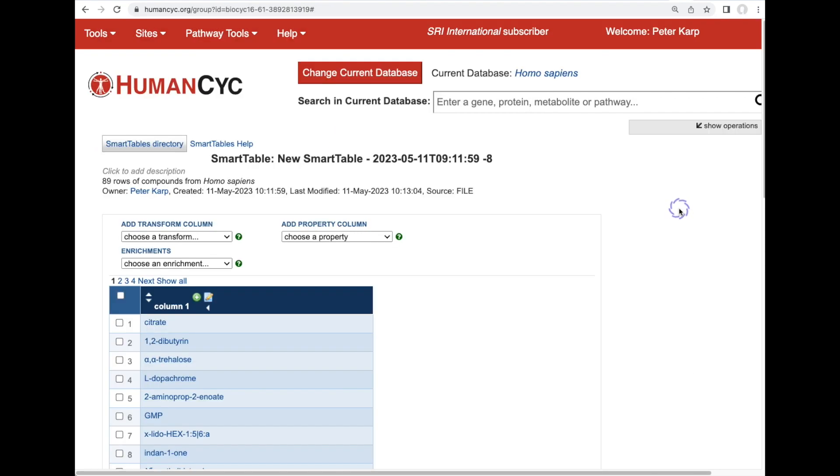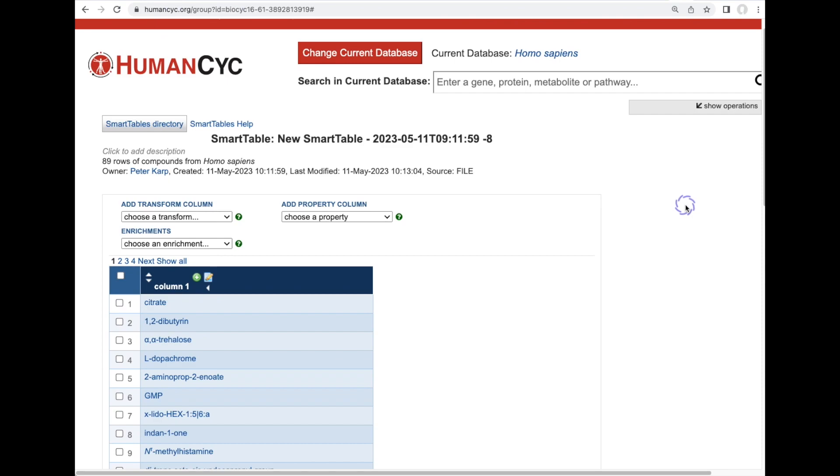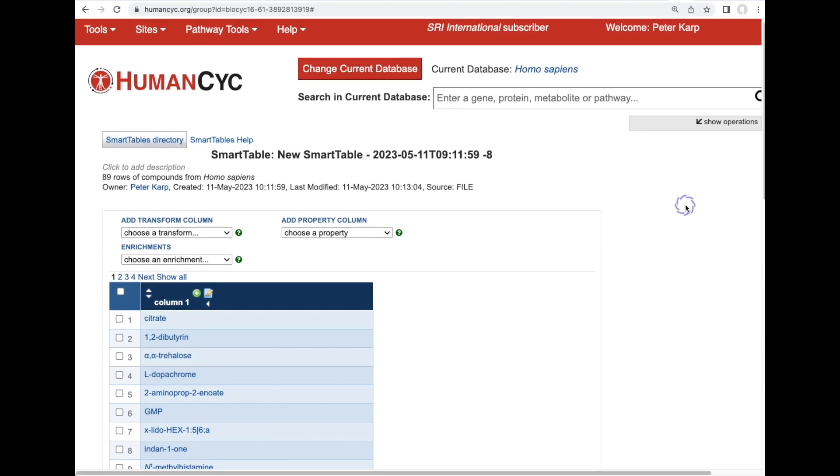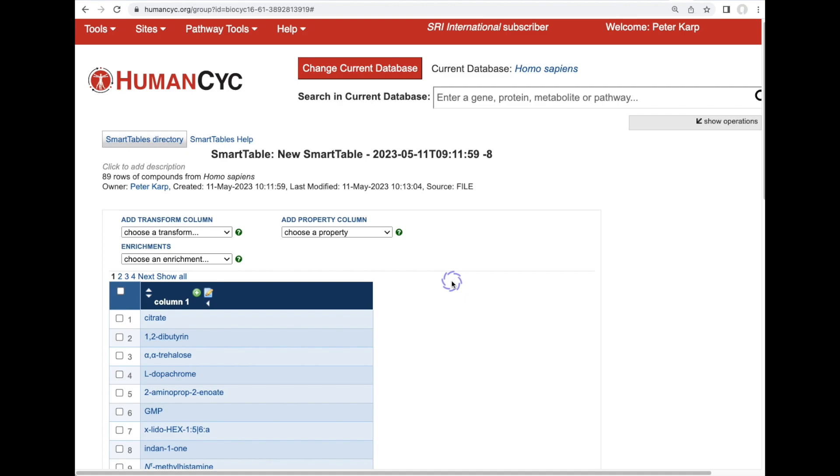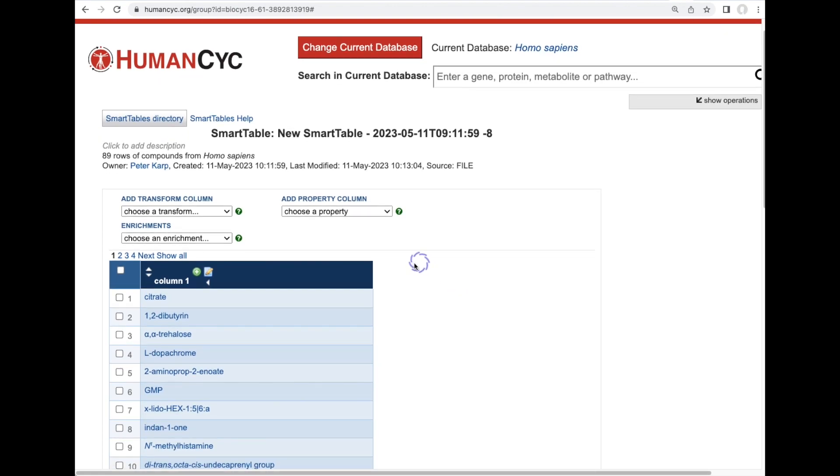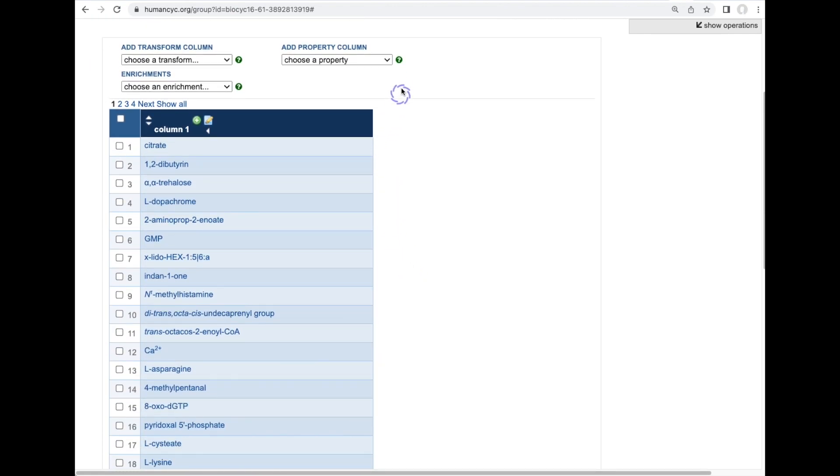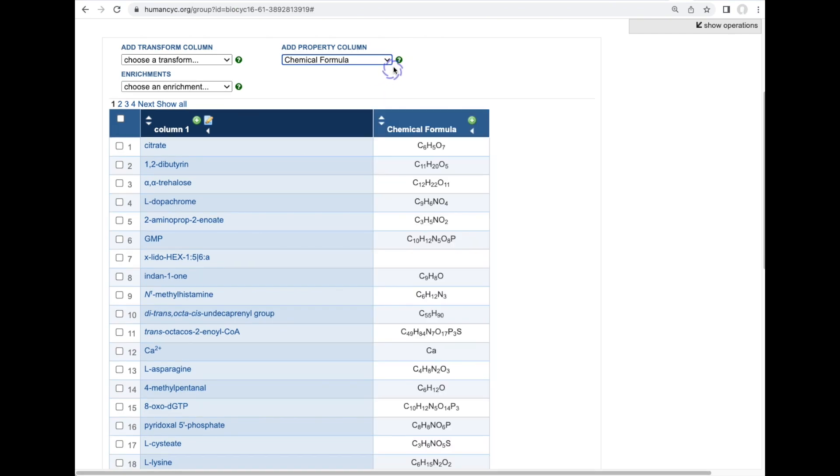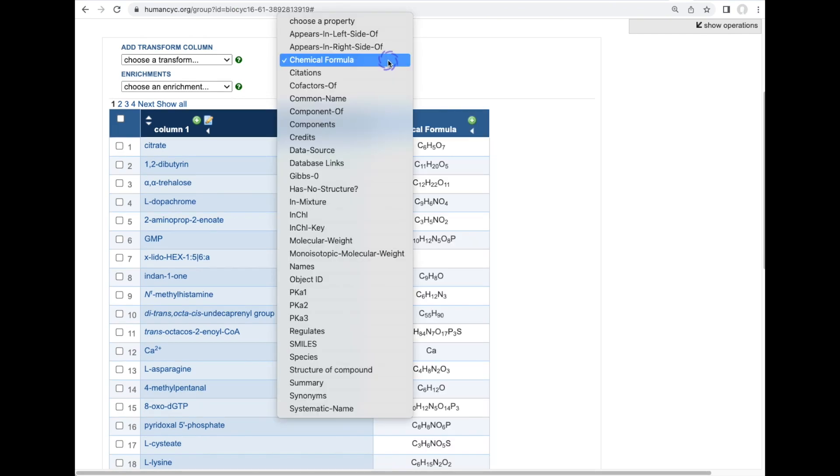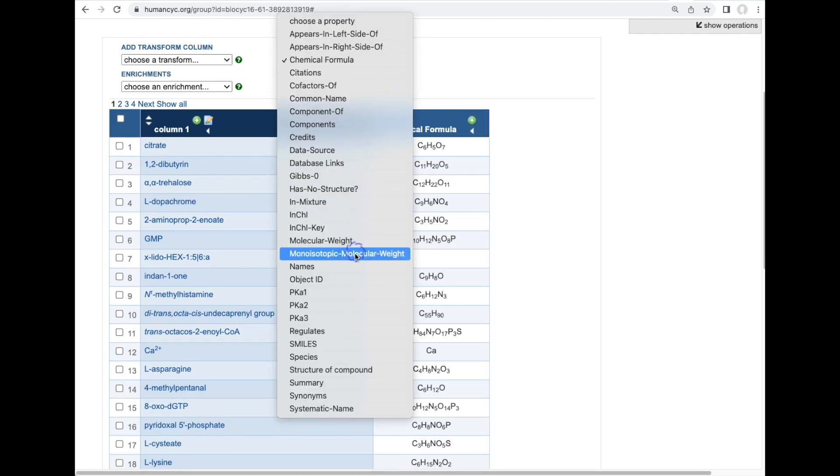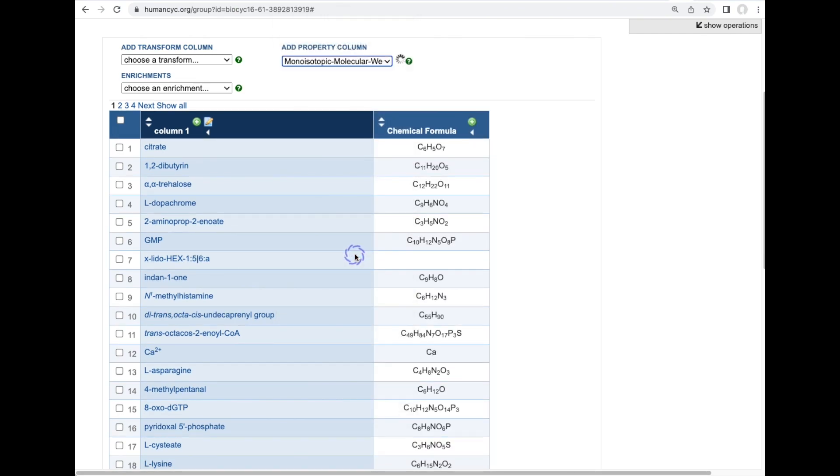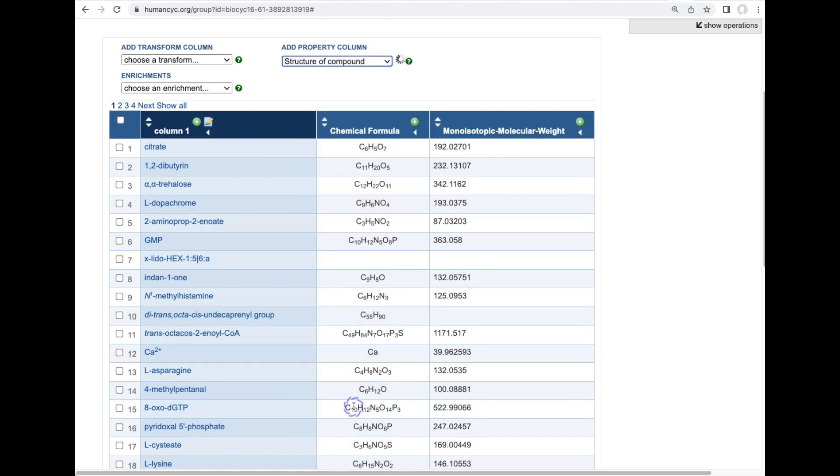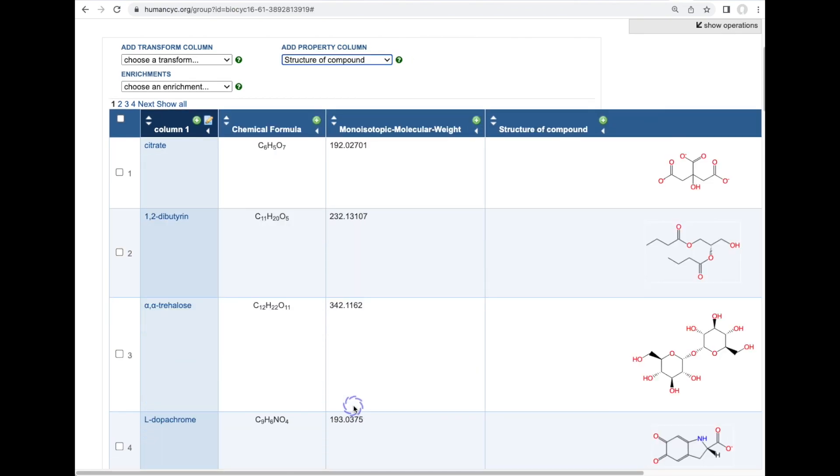A powerful capability unique to BioCyc is called smart tables. Smart tables allow us to upload a set of genes or metabolites or pathways from a file into a stored table within the BioCyc website. In this case we've uploaded a set of human metabolites. We can use the database to add different columns to the smart table such as chemical formula and monoisotopic molecular weight and the chemical structure of each of these metabolites.